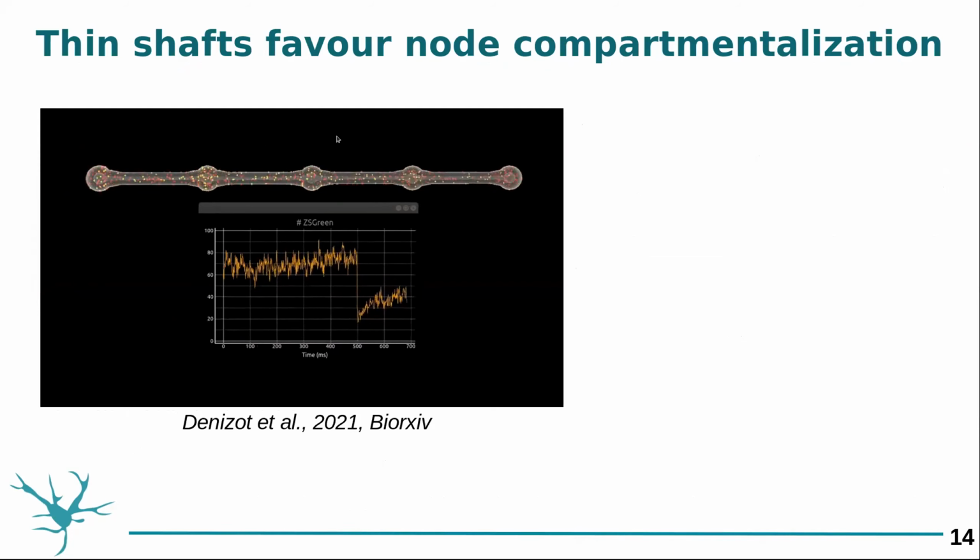And at bleaching time, part of the fluorescent molecules become non-fluorescent. And then the remaining fluorescent molecules diffuse within the cell, leading to a new steady state. And the time it takes to get to this new steady state of fluorescence level is what we call the time to bleaching recovery.